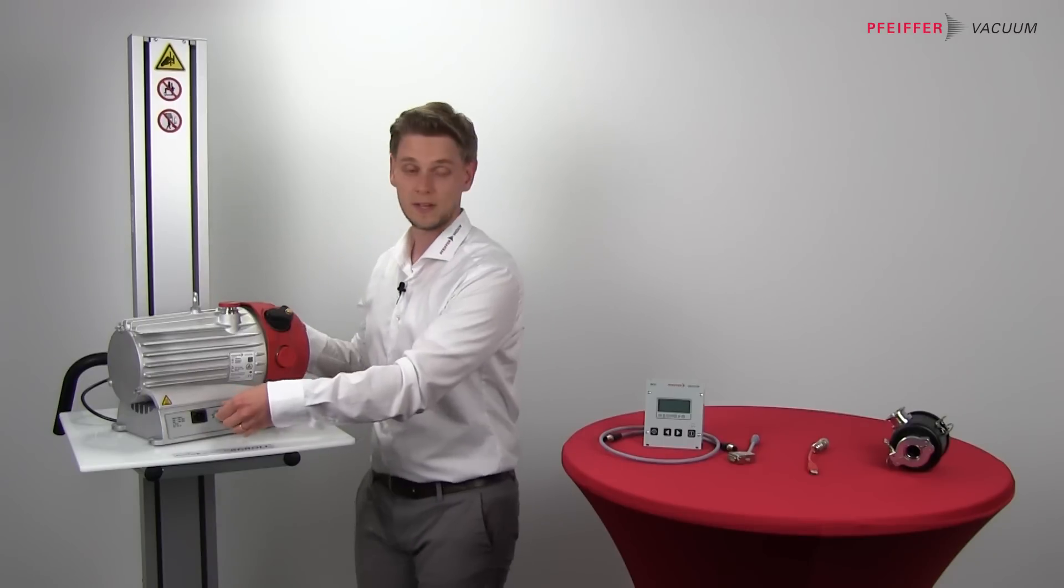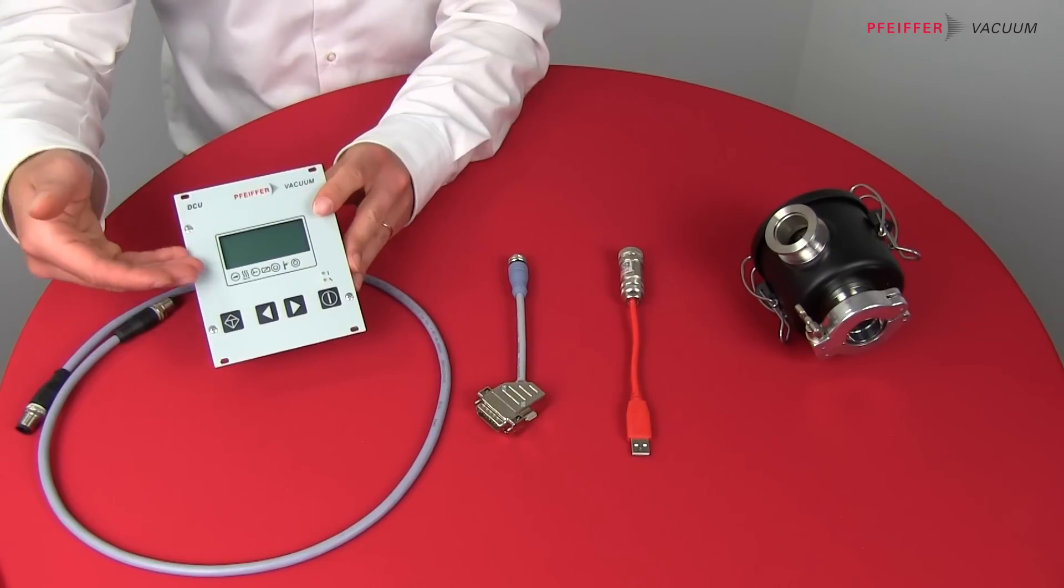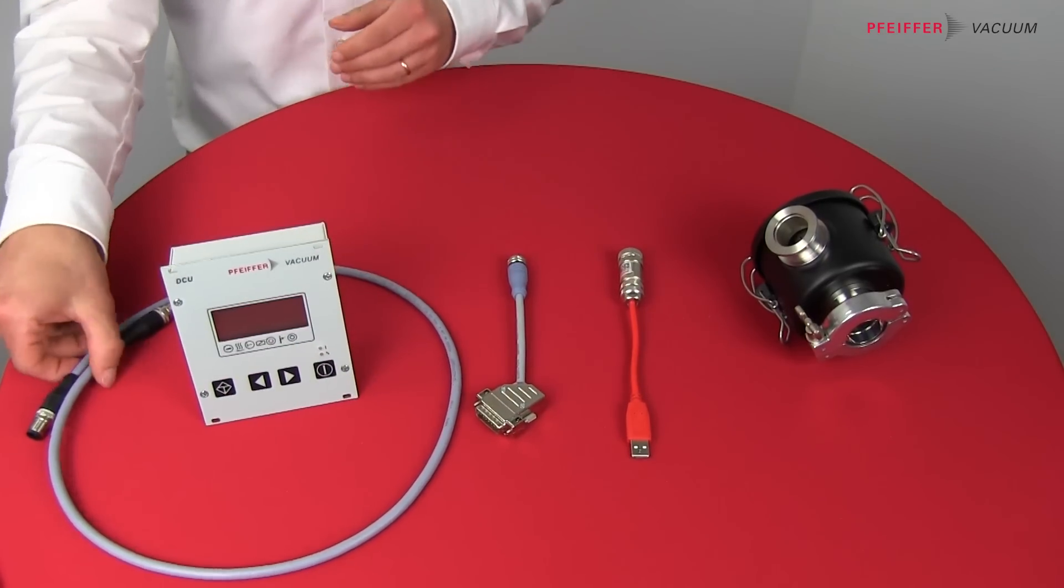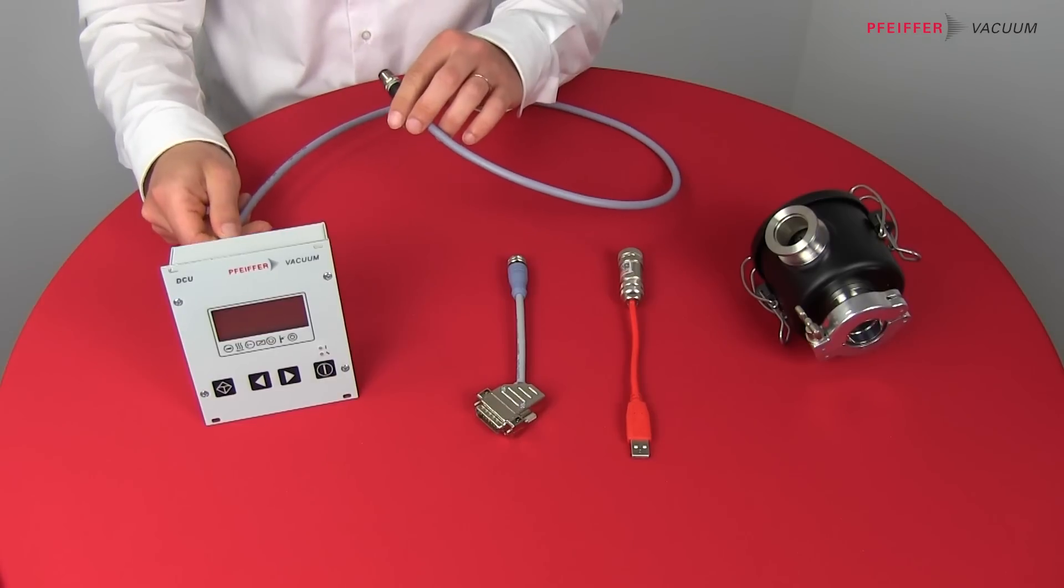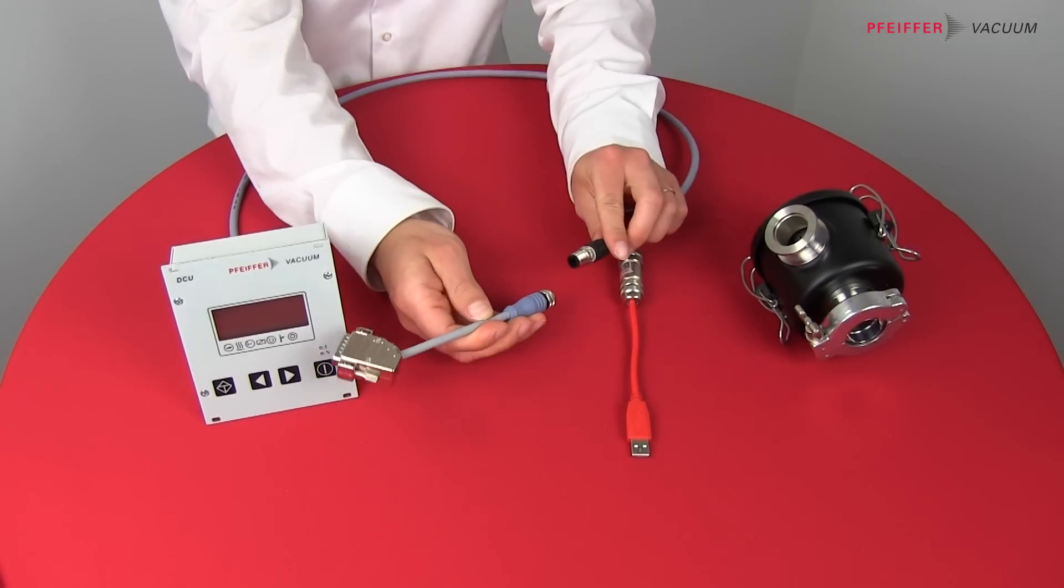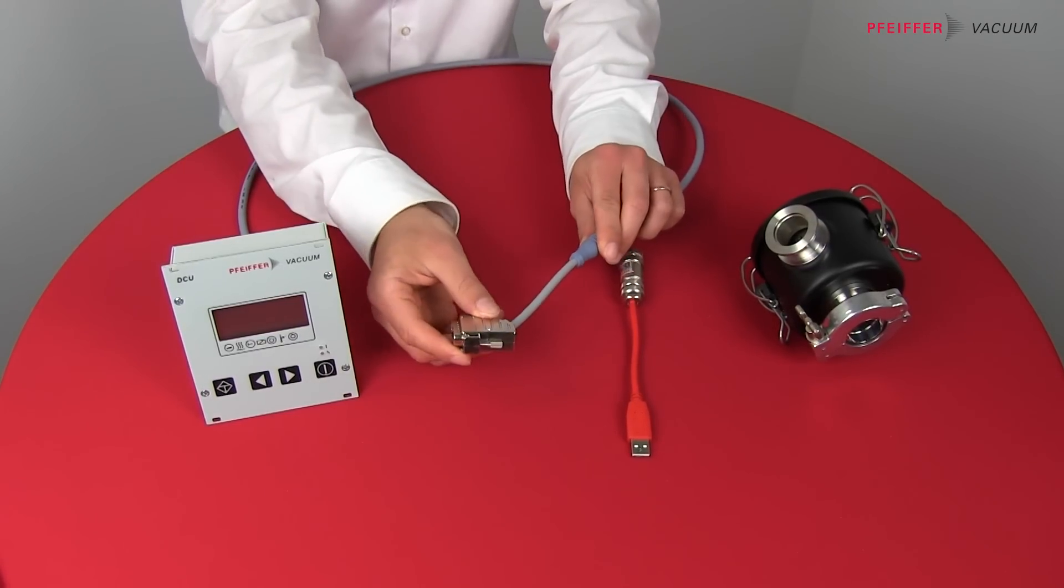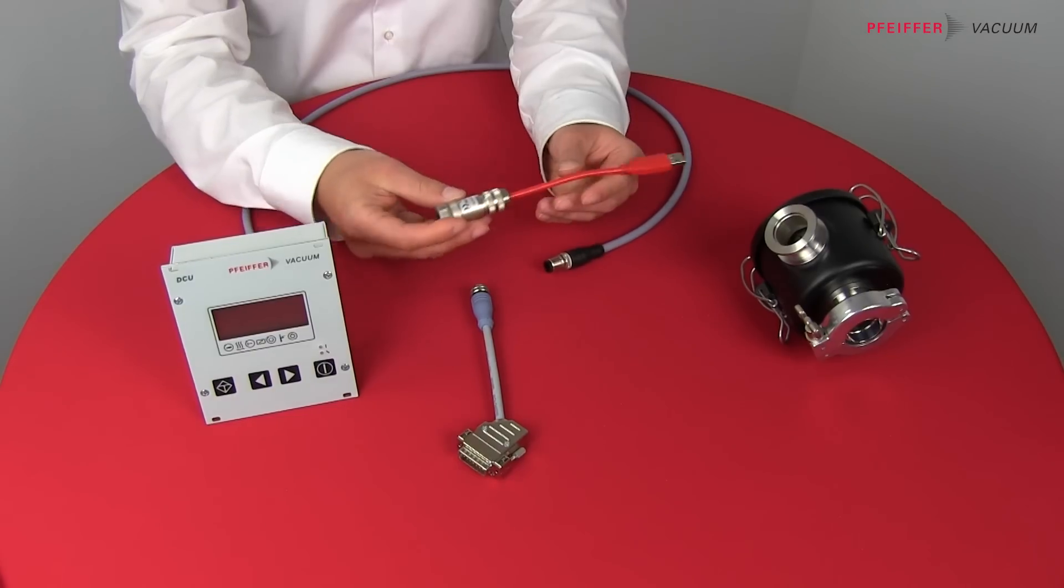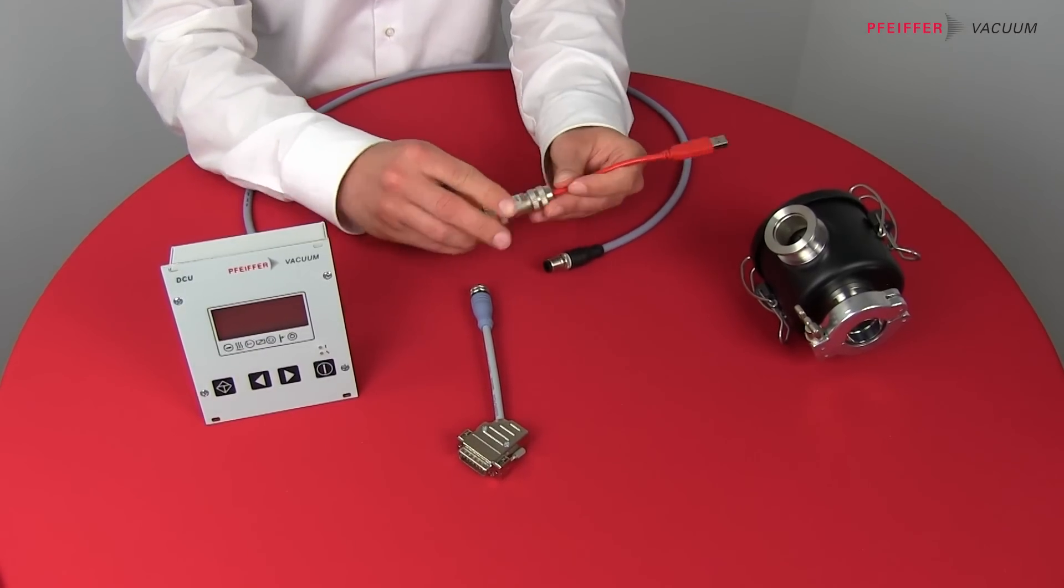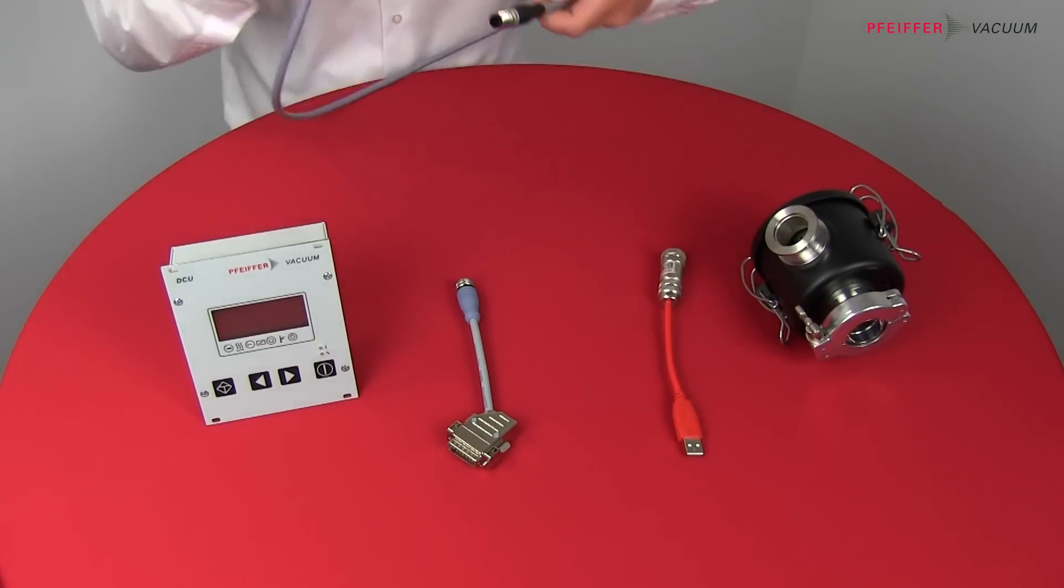And of course there is some additional optional accessory which I can show you here. So we have the DCU002 to show and set the parameters of the HiScroll. To connect the DCU you need the RS485 cable which will be connected to the DCU here. And to connect it to the HiScroll you need this adapter which is an RS485 M12 to Sub-D connector. And additionally if you want to control the HiScroll via PC you can use the RS485 USB adapter together with this adapter. And then you have the possibility to directly control the HiScroll via PC.